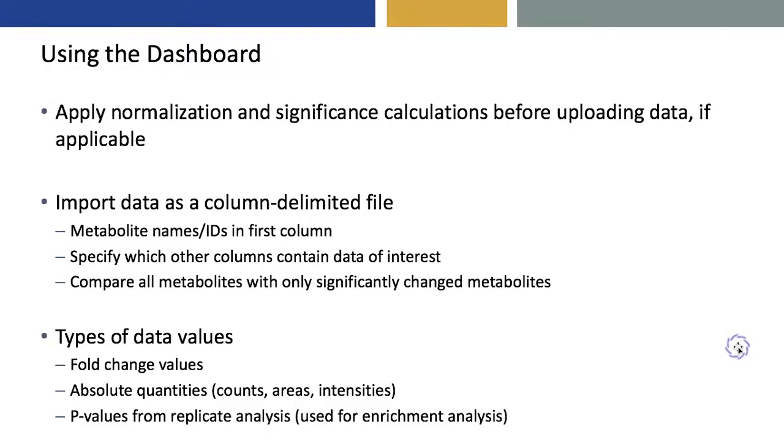Another thing you can consider is we found it useful to load into the dashboard all metabolites, and alternatively to load in only those that have significantly changed values according to the significance calculations, according to some threshold that you would like to define. So you can create different data files in which you've performed that thresholding, and only a subset of the metabolites are available in one of your import files.